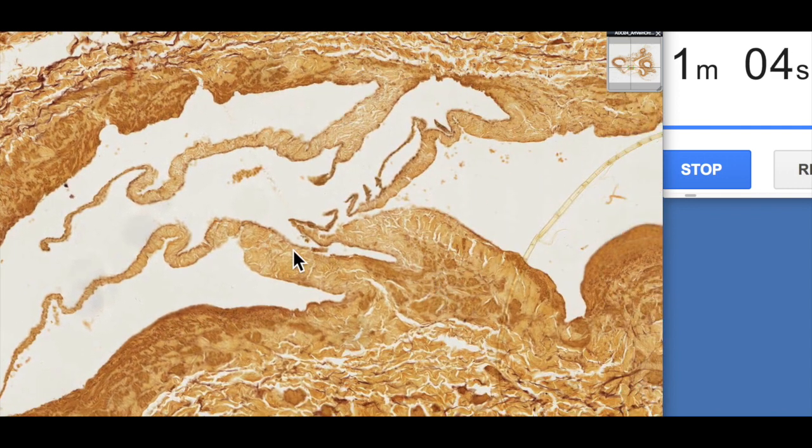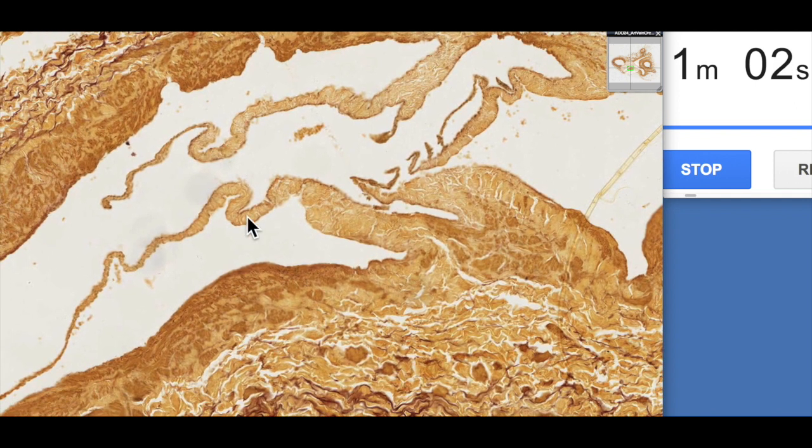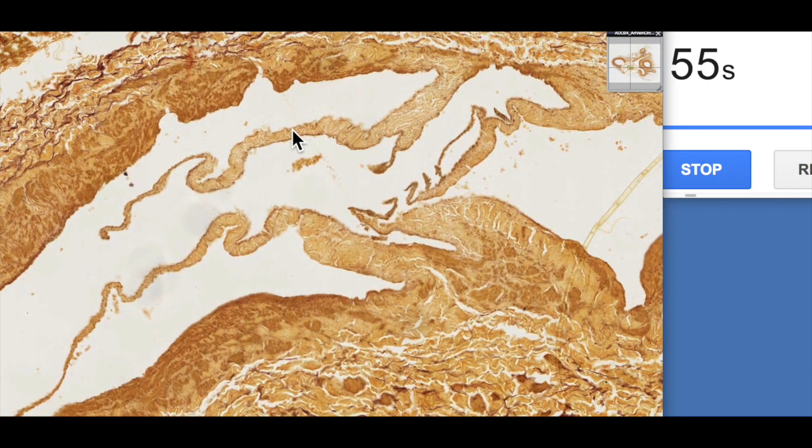And the other feature which is present here, which isn't present in the arteries, of course, are these valves. These are a couple of leaflets of these valves, which are extensions of the tunica intima.